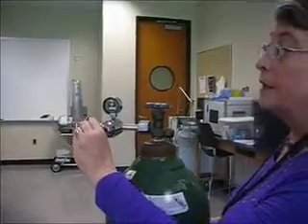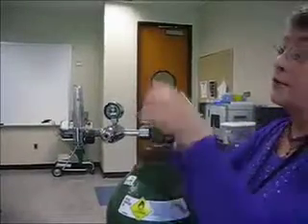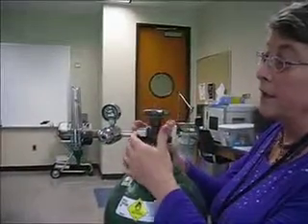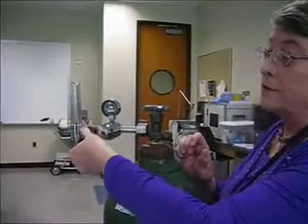When we're done, I can come over here and go ahead and close it. When in doubt, just read. It tells you what's open and what's closed. And the reason why I shut it off when this is still going is I need to bleed out the gas that's in here before I actually close this.